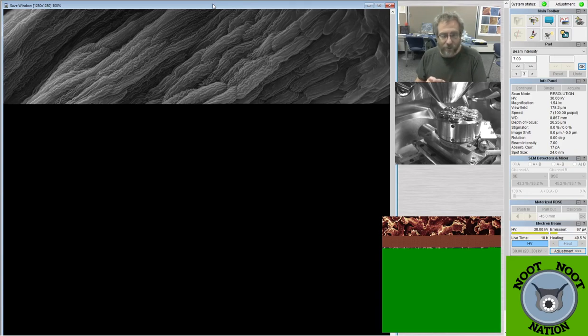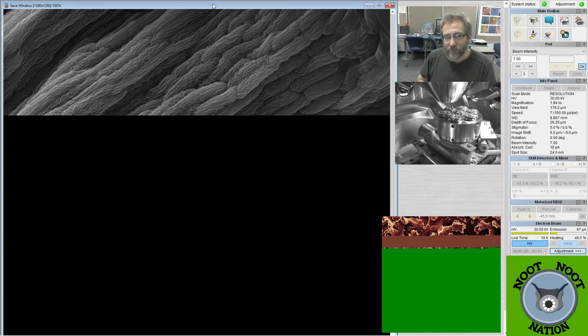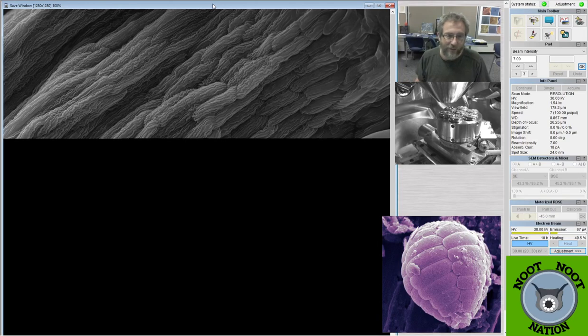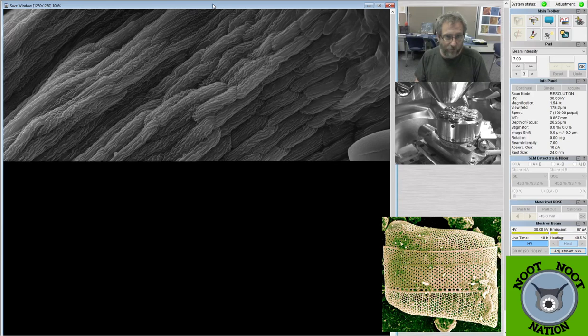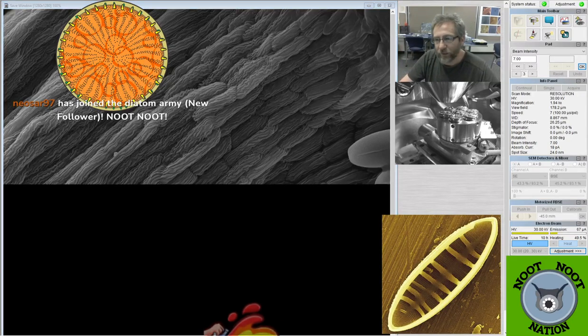And if I used a smaller brush and I put the same number of colored dots on the canvas, you'd be able to get a lot more detail potentially, but I'd have to actually put more dots if I wanted to see more detail, right? Because the size of the brush is smaller. And it's the same thing the SEM's doing, basically. It's got a little tiny dot. It sends back more detail for a smaller area. So I needed to go a little bit more slowly to get the same sort of amount of information back from it. Okay, so I'll try to catch up here.